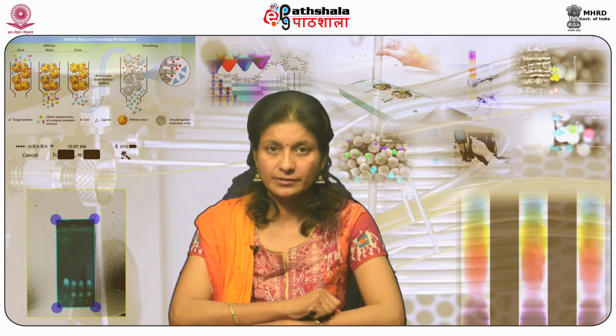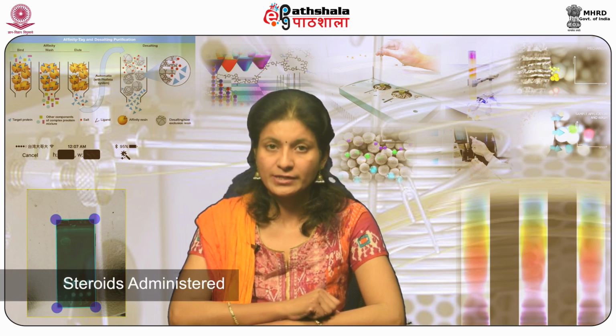It helps in detecting the steroid drugs used by the athletes in international sports competition. Steroids administered to the animals in traces. It is able to retain and separate some compounds that cannot be separated by other methods, for example, geometrical isomers.